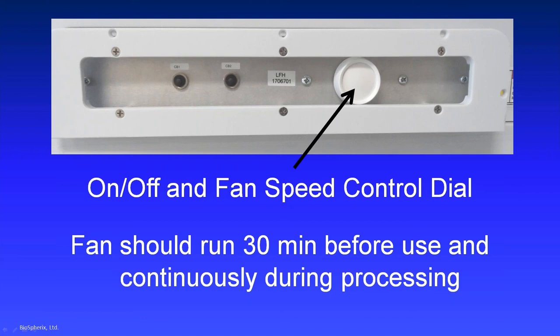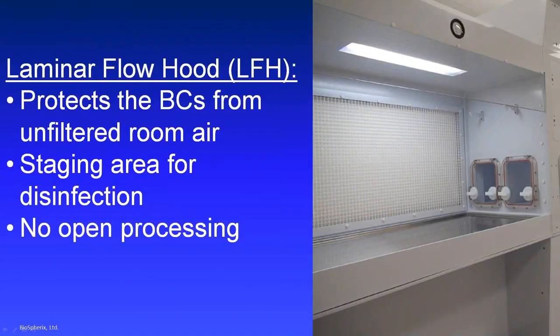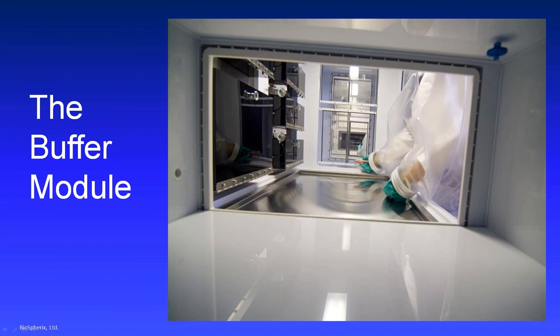Now, we have had some customers that didn't realize there was even a button back there to turn it on, and it was on the back of their system, and they pushed the Xvivo system right up against the wall, and they didn't even know it was there. So we want to make sure right off the bat that you know there is a button for the LFH and how to turn it on. It's right there. The laminar flow hood protects the buffer chambers from unfiltered room air coming in. Like I said before, it's a staging area for disinfection. This is not the area for open processing. We want you to do that inside the Xvivo system.